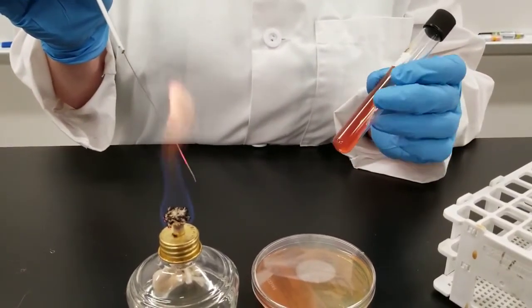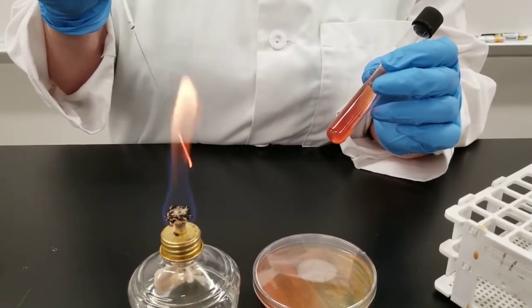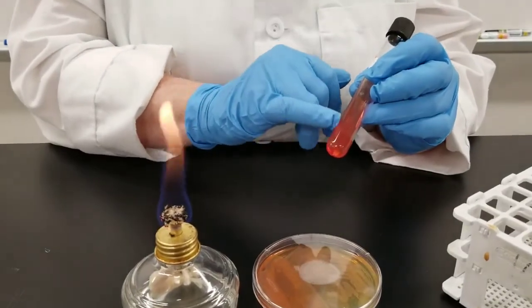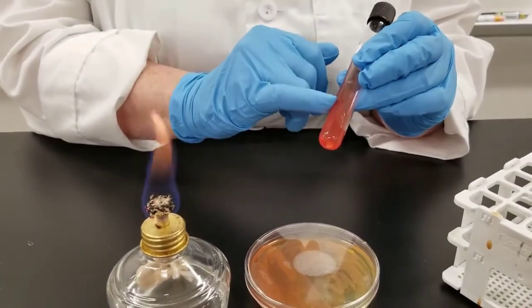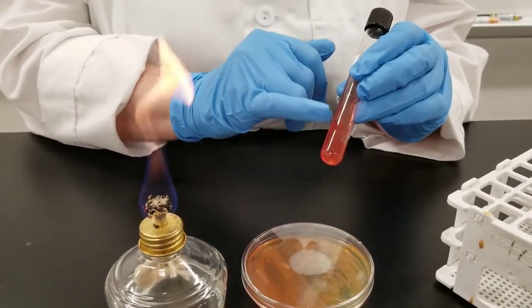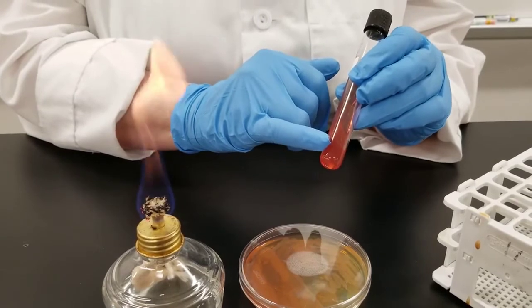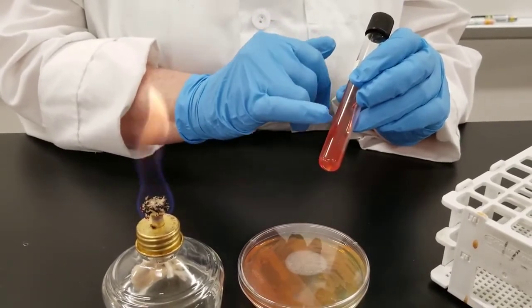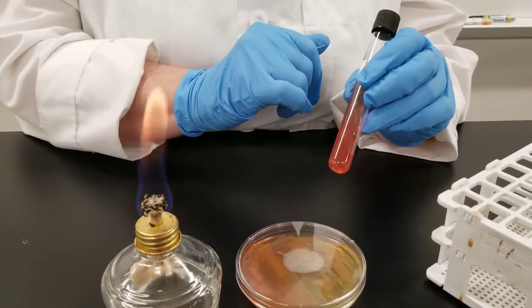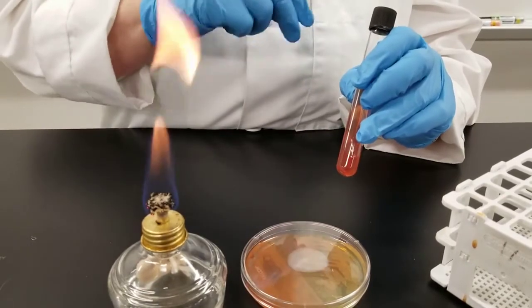What we've done is inoculated down in the bottom area — this is the slant, and this is the butt. We are going to look at the results, and depending on the organism, sometimes you get different results on the slant versus the butt. Some organisms you will get the same result, some you will get different results. That's why we have to stab down into the butt.